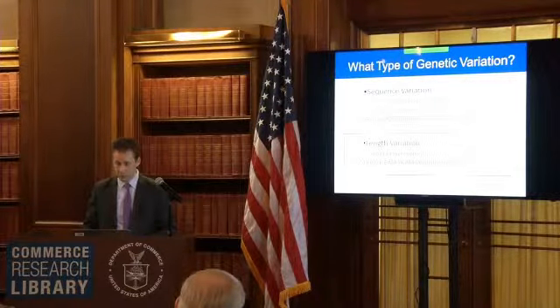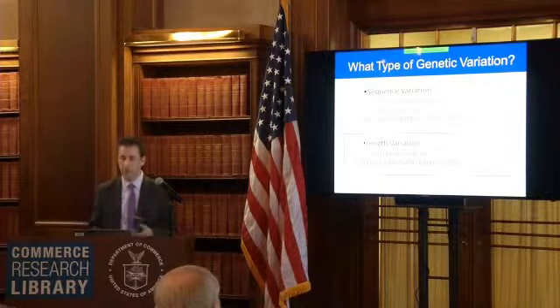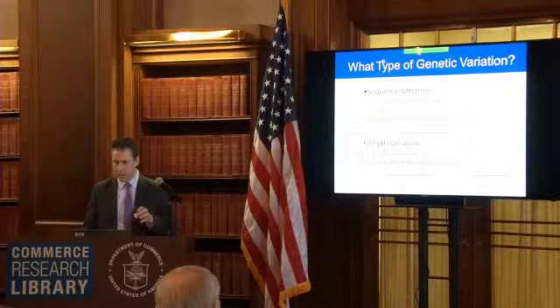What we're going to talk about more in focus today is called length variation, or short tandem repeats, or STRs. And this is really the workhorse of identification.